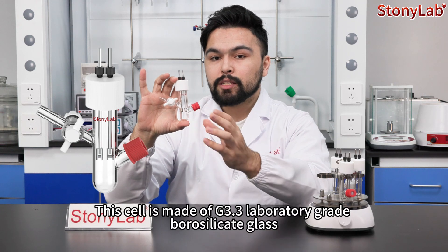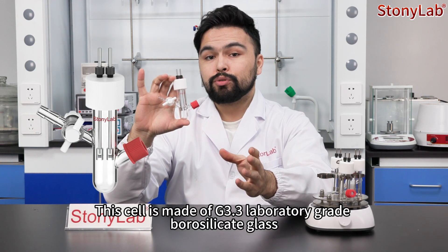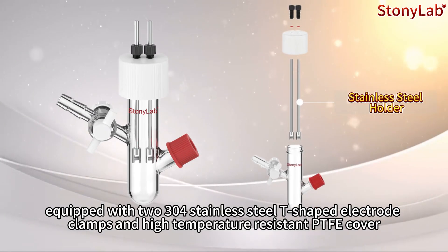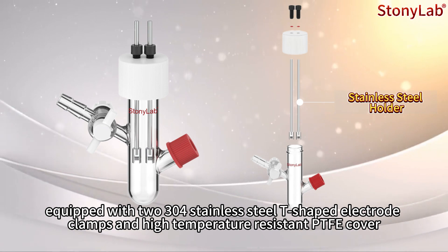This cell is made of G3.3 laboratory grade borosilicated glass, equipped with two 304 stainless steel T-shaped electrode clamps.